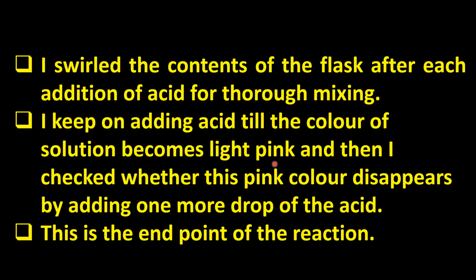After that, I note down the final reading. Then I find the difference between the initial and final readings of hydrochloric acid solution used while titrating with sodium hydroxide solution. Definitely, I have to repeat the titration for accurate readings.